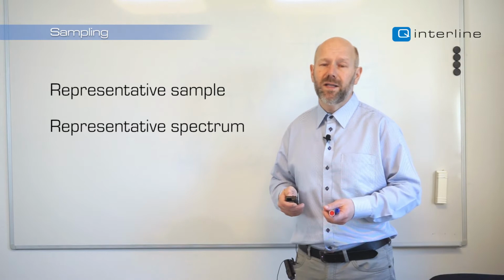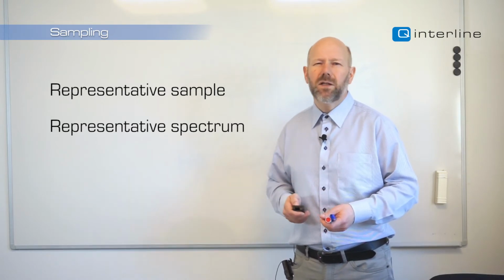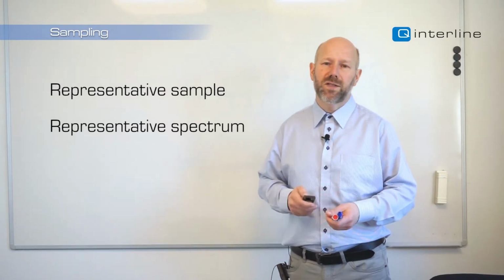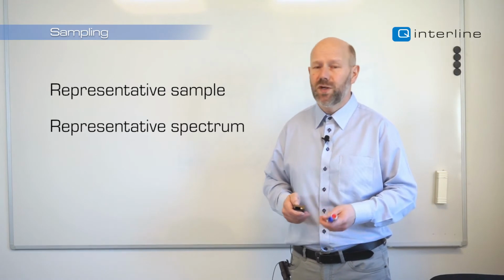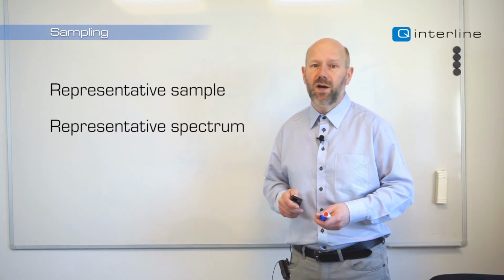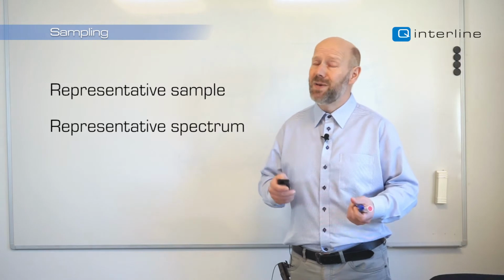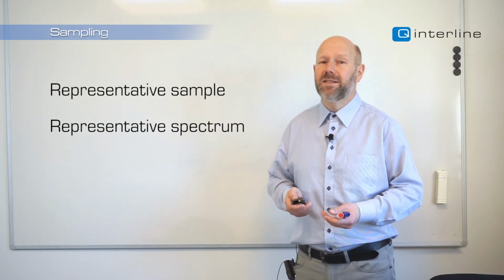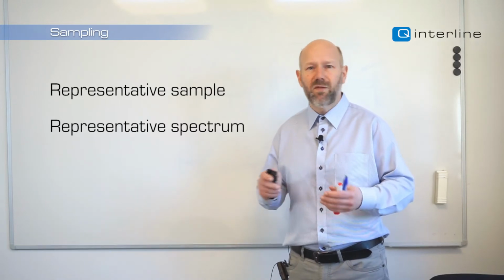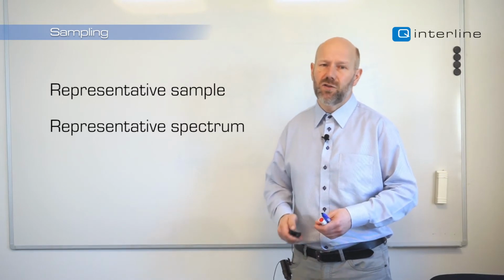By spinning and co-adding spectra, we'll get a much more representative sample, but it's not irrelevant how it's done for liquids, pastes, powders, and more heterogeneous produce. So we better watch out for these things. Likewise, it's important that we are aware that a sample may segregate, dry up, sediment, change its temperature, and certain particles may be favored to drop to the bottom of a petri dish and similar stuff. So presenting the sample to the analyzer is not trivial.